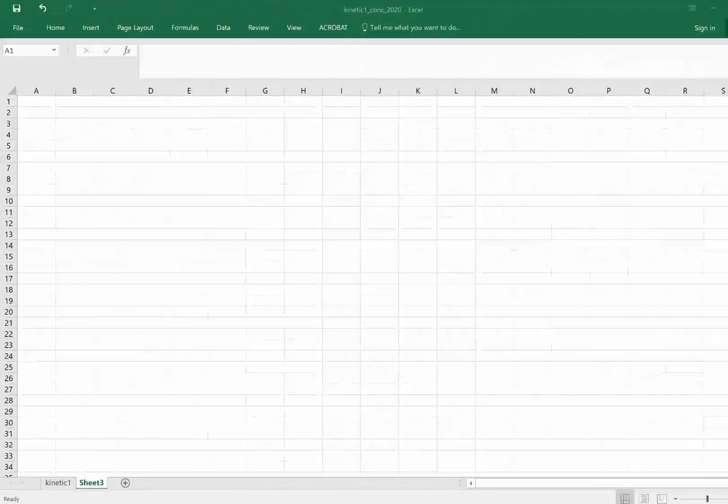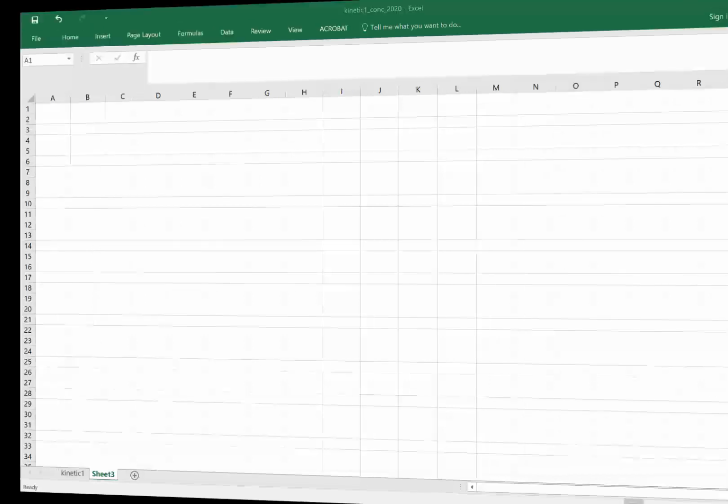This video talks you through the steps related to data processing for lab N. I'll show you how to import a text file, how to manipulate the data related to that text file, ultimately make some graphs and process at least one of the graphs. I'll assume that you have exported your data to a USB memory stick, that you've inserted the memory stick into a computer and you're ready to import the data into Excel.